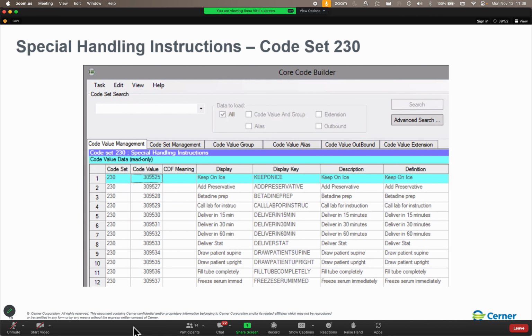And we can have multiple site prefixes pull from the same pool. So Christian, for example, you could have an outpatient pool and then just assign each of the site prefixes for your outpatient destinations.